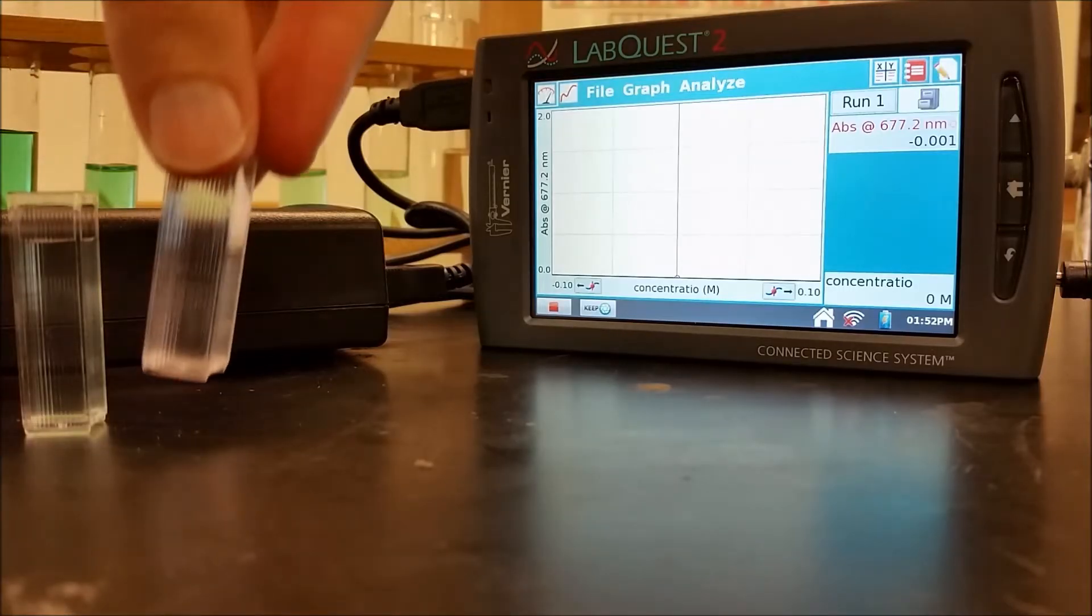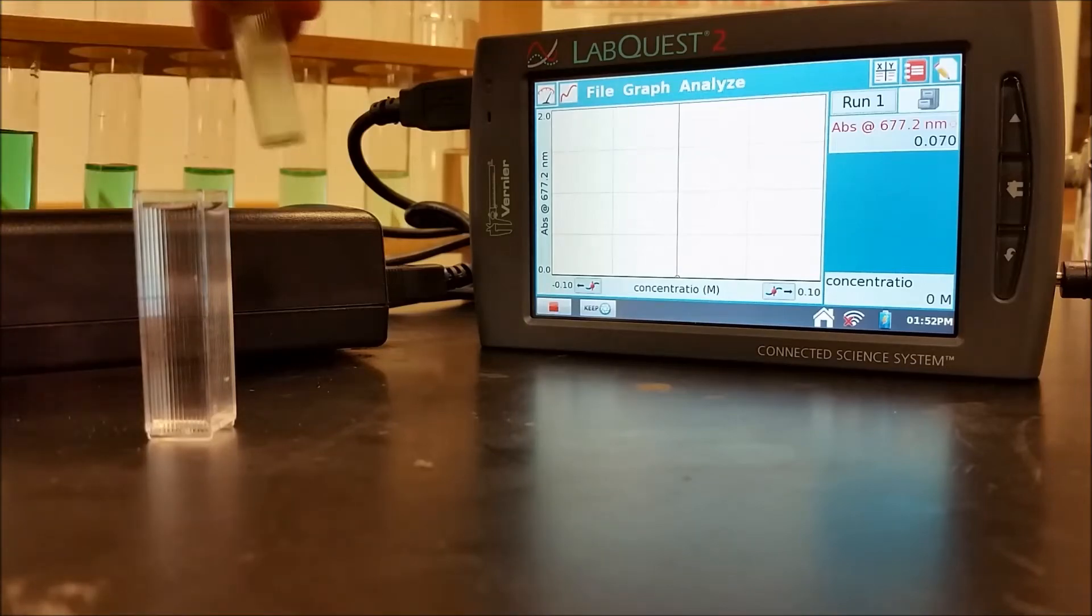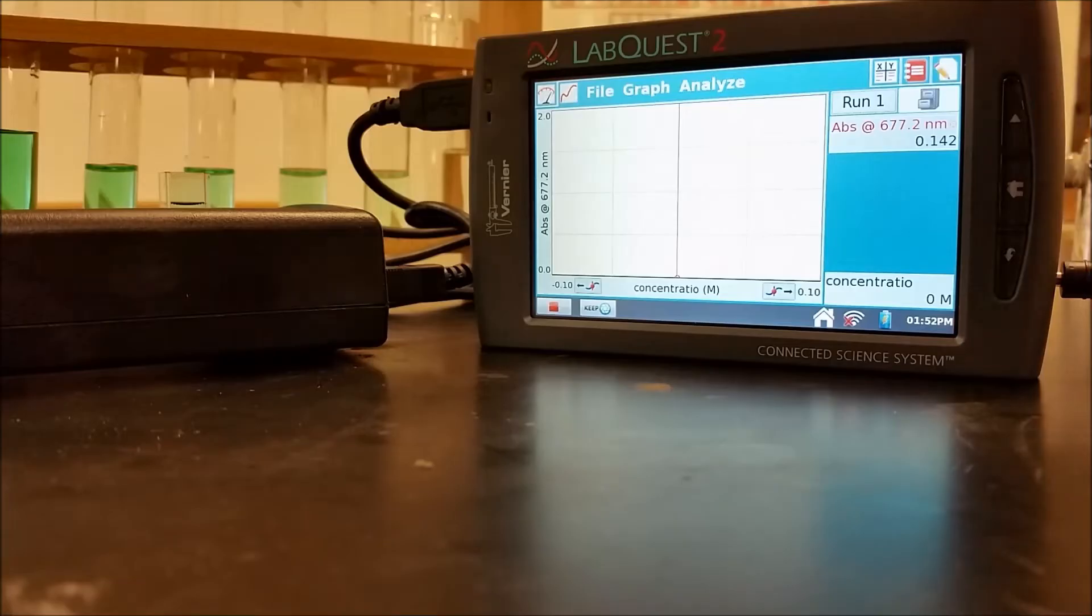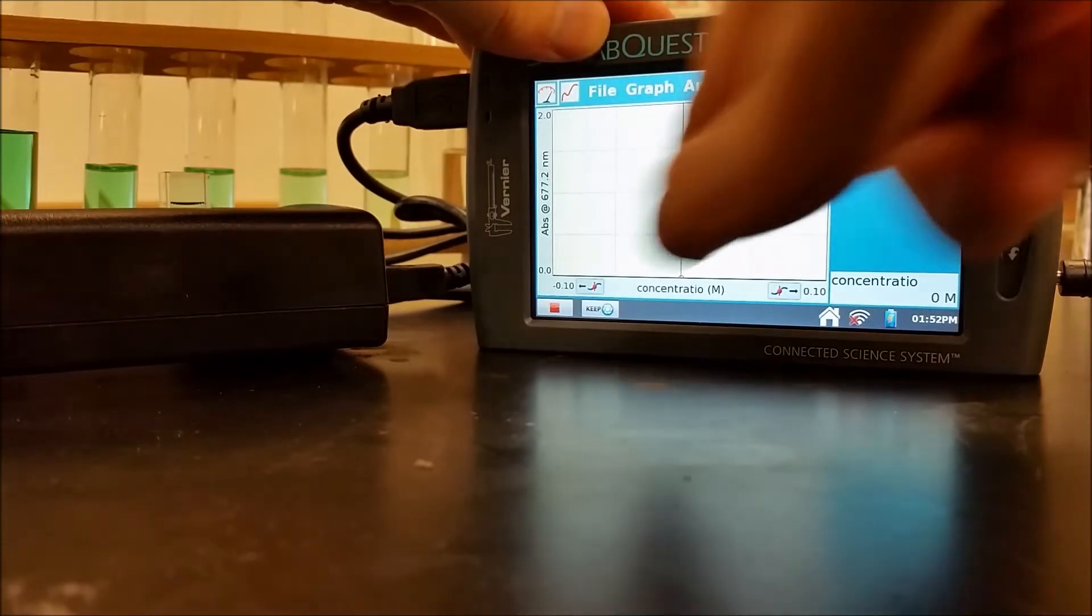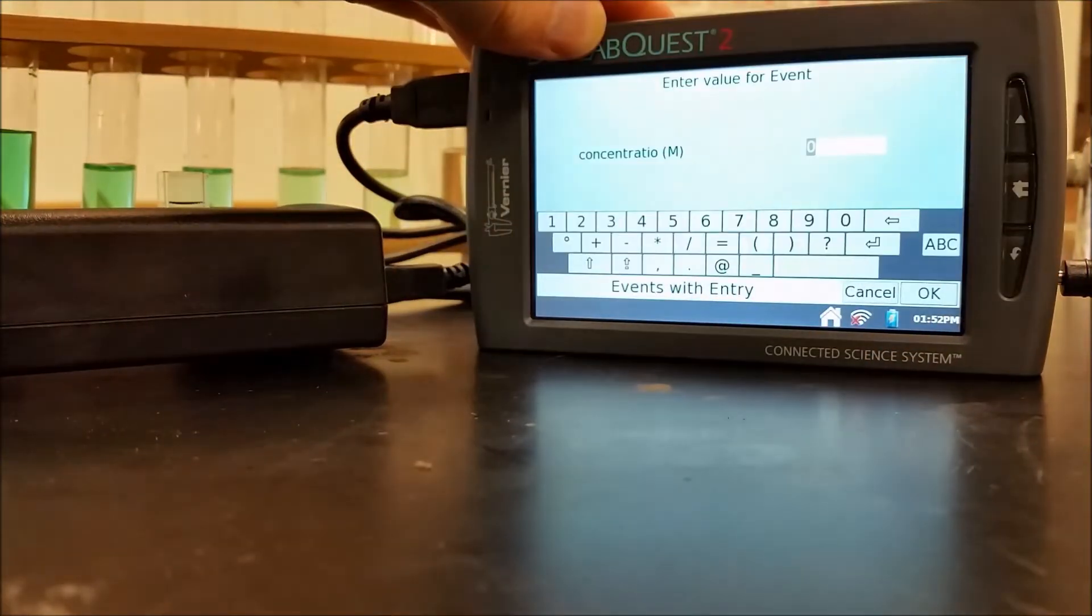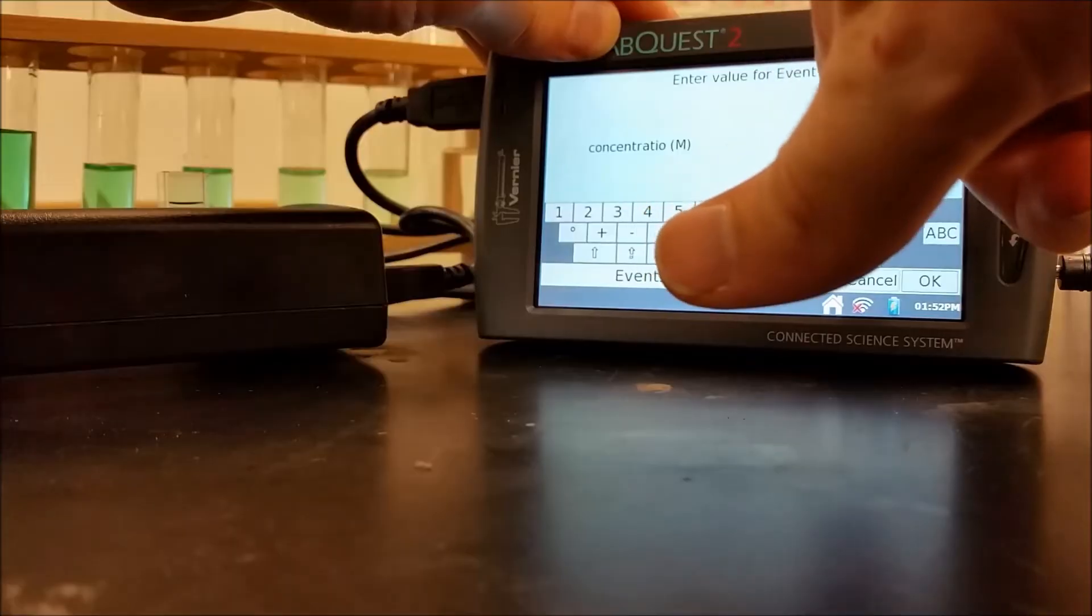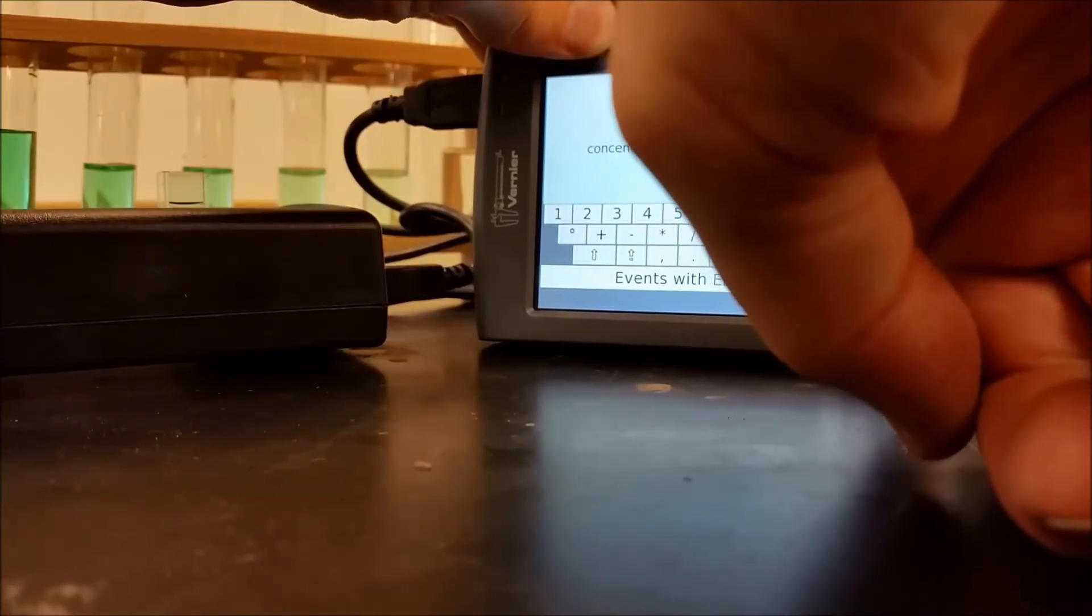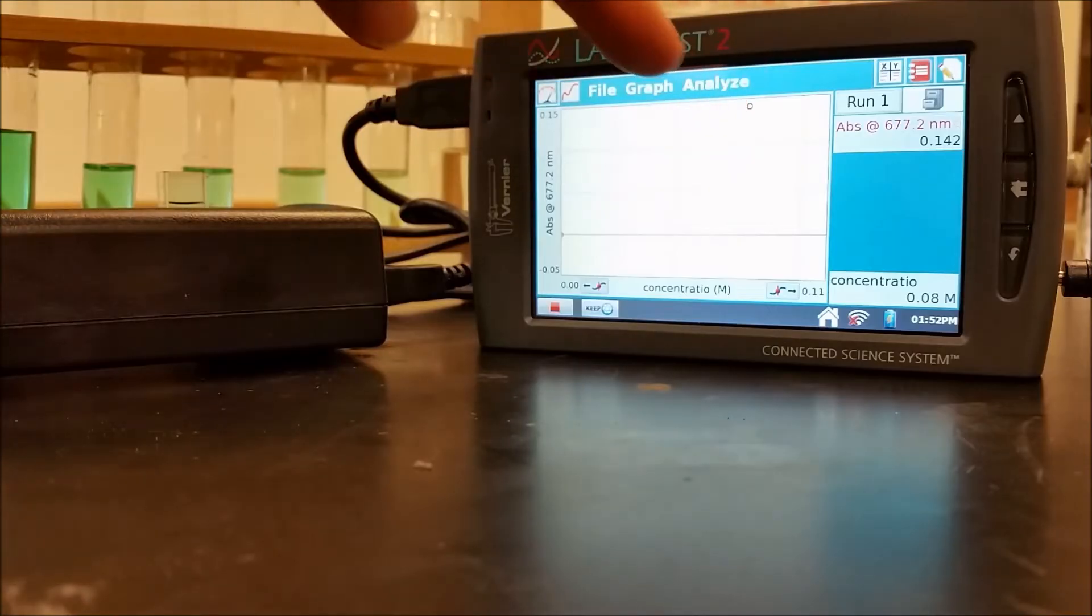So now I'm going to take this out and put in my next one, my 0.08 molar. So I'm going to put that in over here. So now I do have an absorbance, this 0.142. I'm going to hit Keep and type in my 0.08 for my concentration. So that's now plotting what my concentration is versus what my absorbance is.